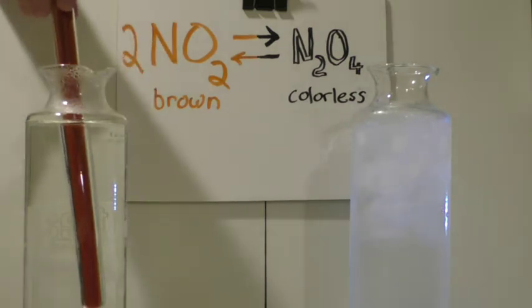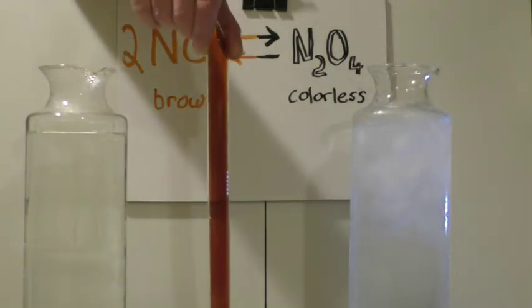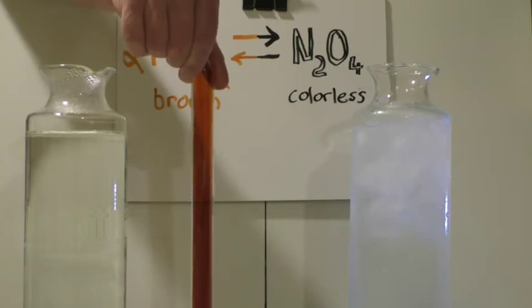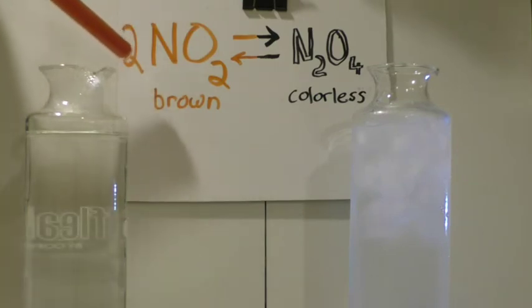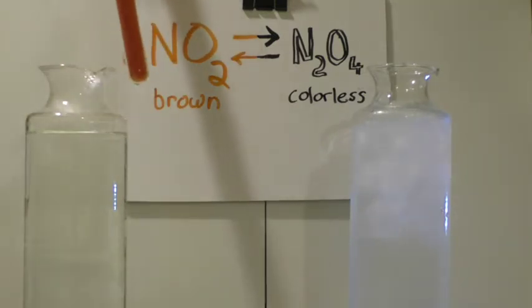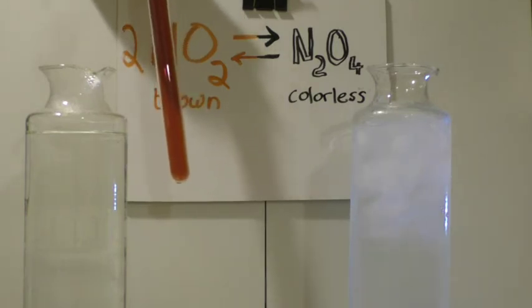And my reaction vessel, where all the action's going to occur, is this sealed glass tube. And this glass tube was made by evacuating all the air out of it and then just pumping it full of NO2 gas. And NO2 gas is a really toxic brown gas. This is the same gas that makes photochemical smog on hot days, makes the air look kind of brown. And so when we start out, I can think about, well, this tube contains some NO2 brown gas, and somehow I'm going to let the reaction start.